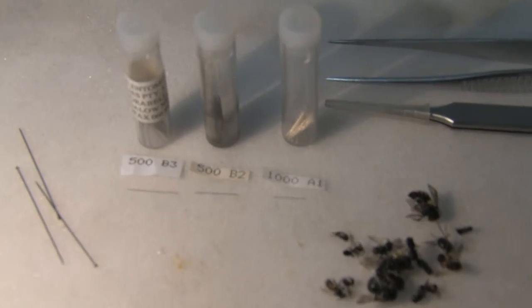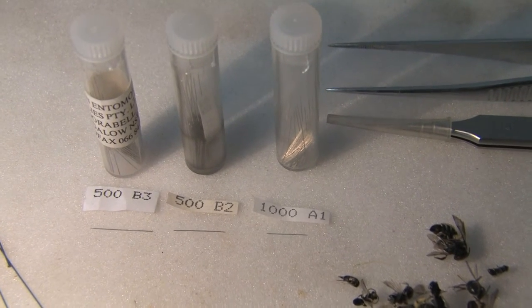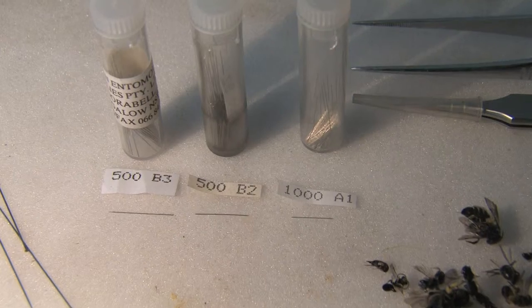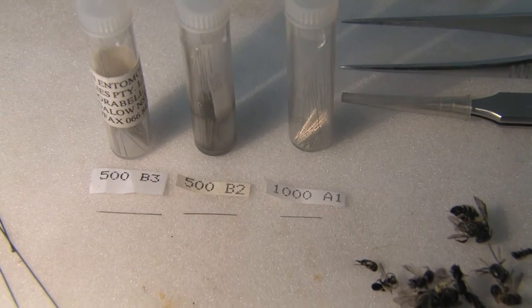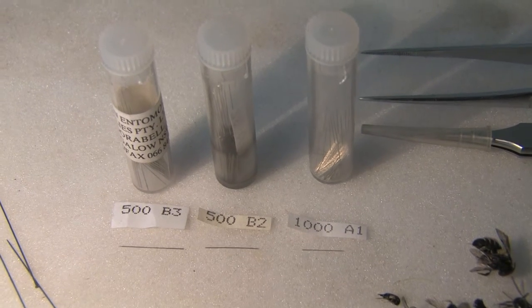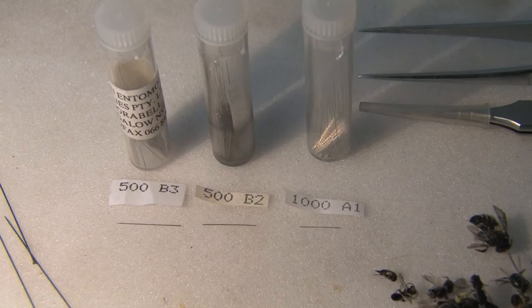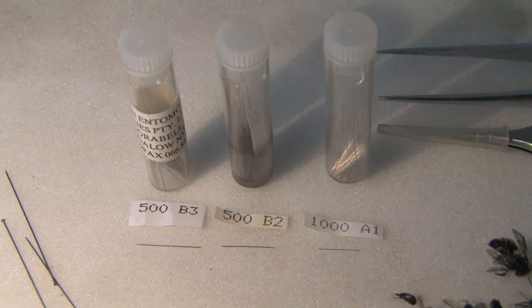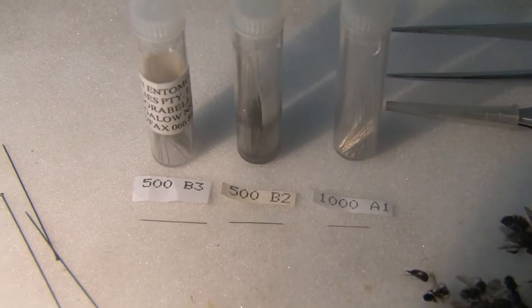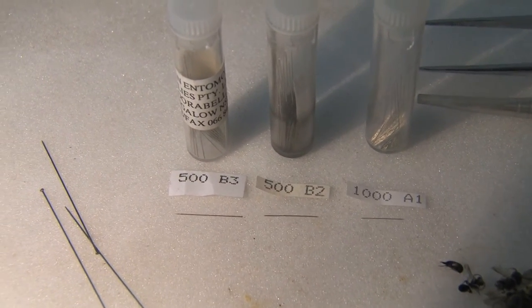Down the bottom here are the micro pins or minutens that I use. The smallest is called the A1, and there are a thousand of those in a tube. The medium size is the B2, and there are 500 of those. The last ones are the B3s, and again there are 500 in a packet. The A1 is the smallest, the B2 is the medium, and the B3 is the largest.